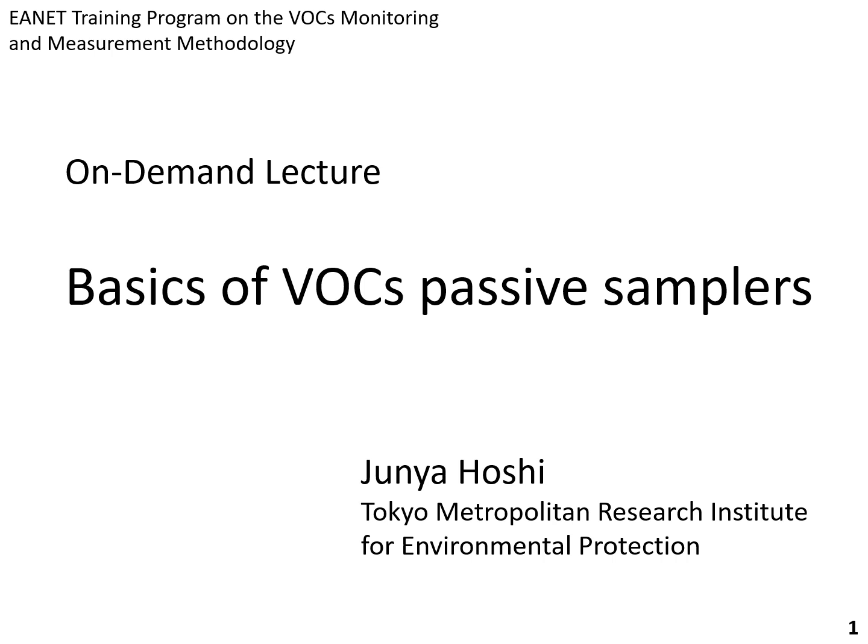I will now explain the basis of passive sampling, an example of sampling rate calculation, and practical examples of sampling rate, sampling, and extraction from solvent tube.